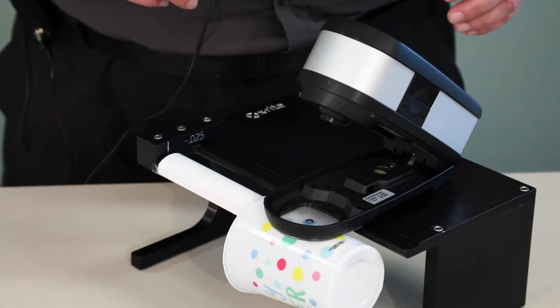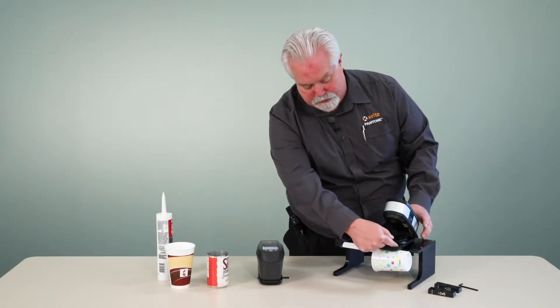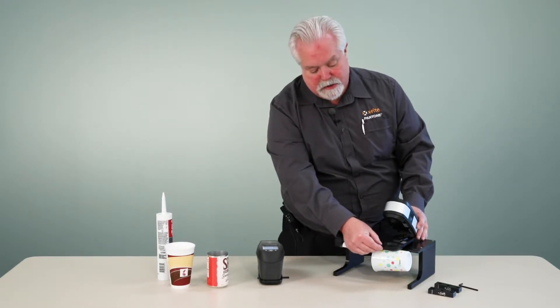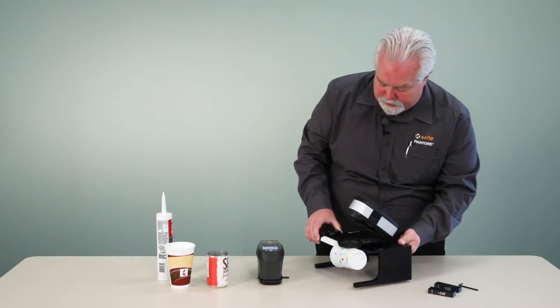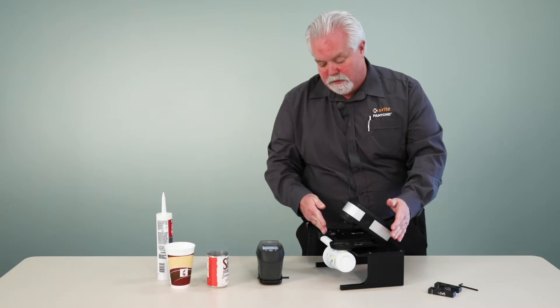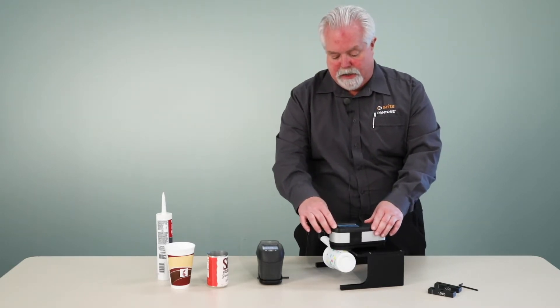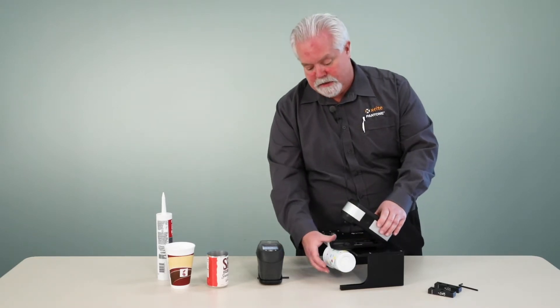With the X-Act there's two molded marks, one on each side of the instrument, that are in line with the optics, and we have a scribed mark here on this height adjustment block. What I do is visually align those three marks and I know that I'm in the right place. Then I simply close the instrument and take a measurement.